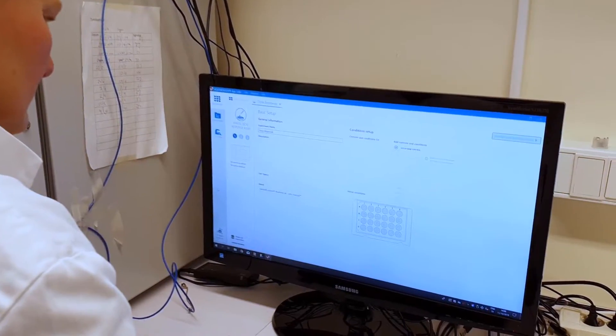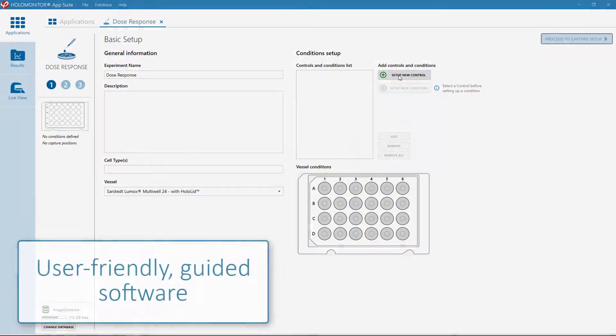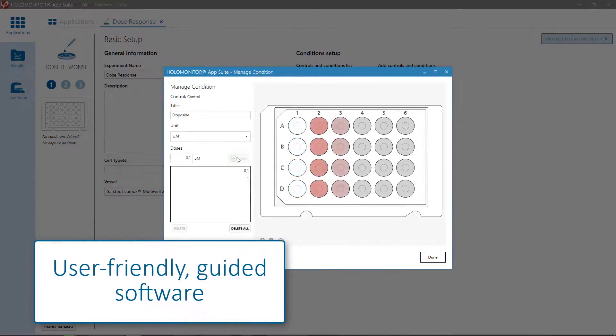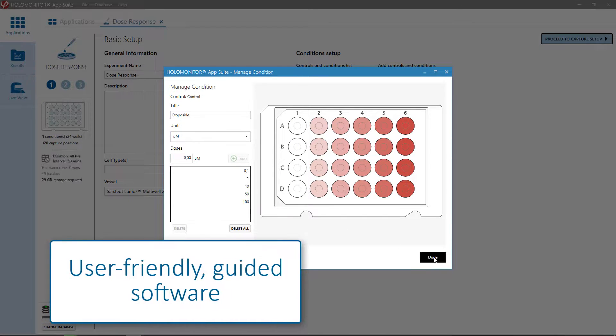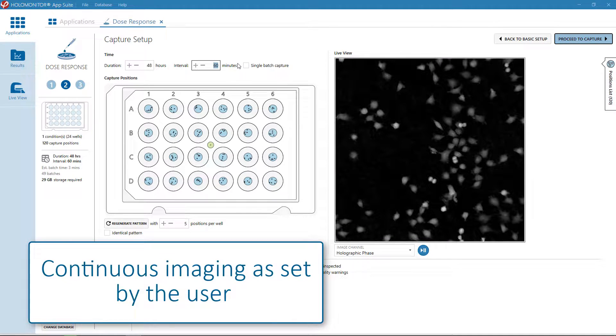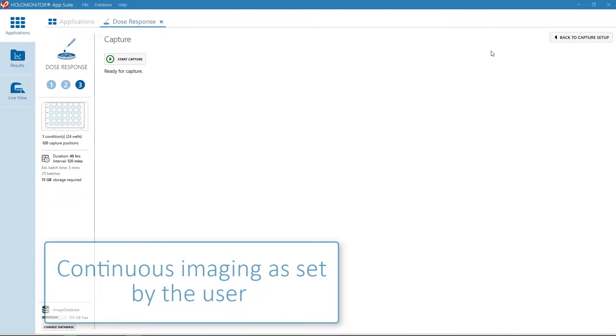The user-friendly AppSuite software allows you to set up the experiment in just a few minutes. Holomonitor will then take images of your cells for as often and as long as you wish. No further supervision is needed. Holomonitor will take care of the rest.